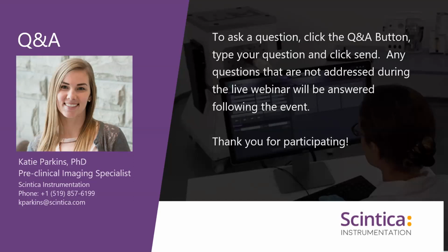But I would say with optical, because it is typically a 2D modality, you do have lots of options to use other complementary modalities, even though they're not in the same system. So for example, you could combine it with MR or even PET if you wanted to do that, even if it's not in the same system. But yeah, I would say it's similar to PET, where you can definitely have those options to integrate.